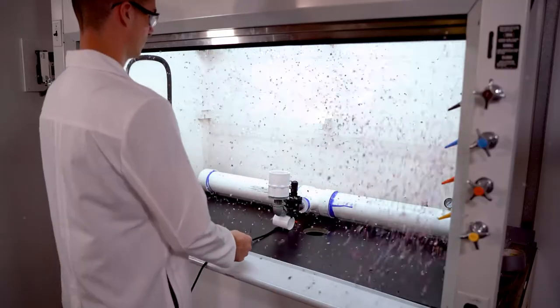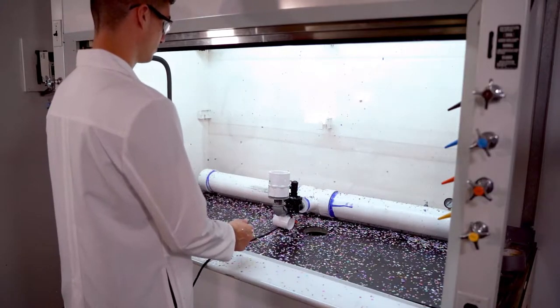If this confetti were flames, chemicals, and shattered glass, he would be seriously injured.